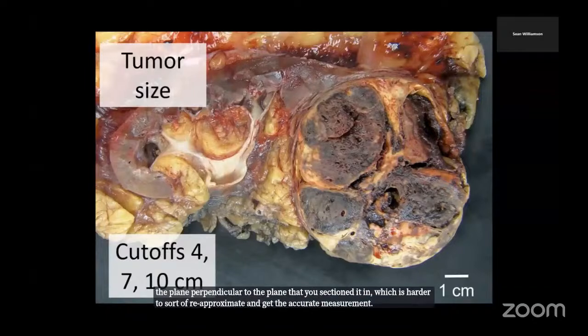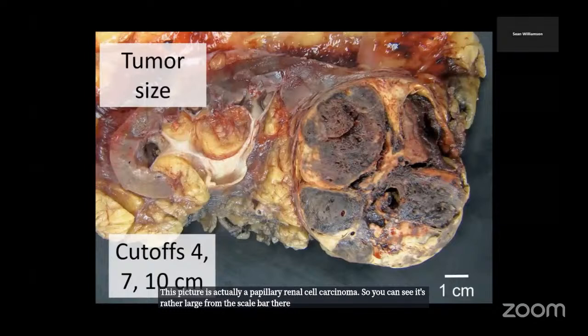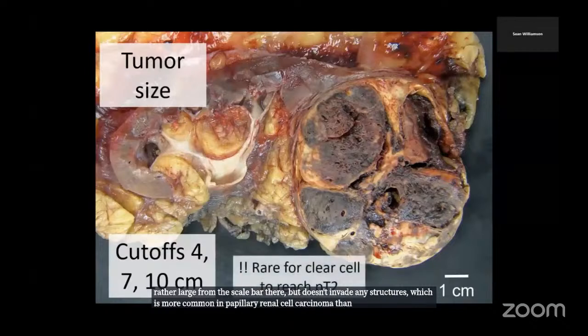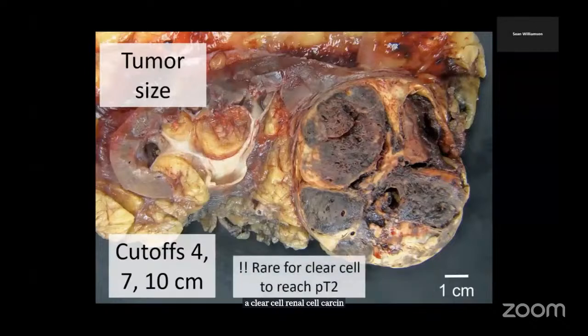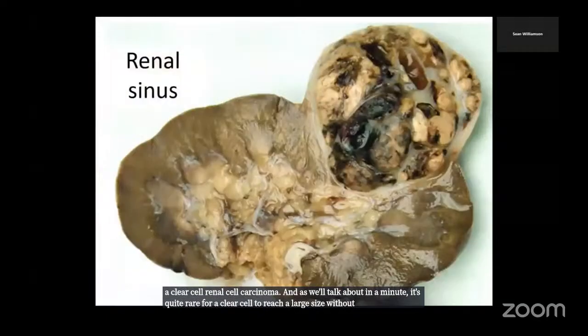This picture is actually a papillary renal cell carcinoma. So you can see it's rather large from the scale bar there, but doesn't invade any structures, which is more common in papillary renal cell carcinoma than a clear cell renal cell carcinoma. And as we'll talk about in a minute, it's quite rare for clear cell to reach a large size without invading any structures.